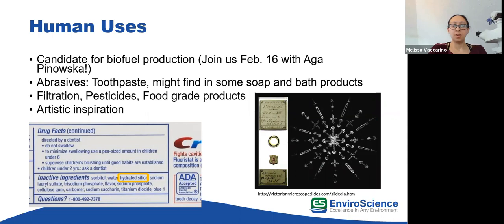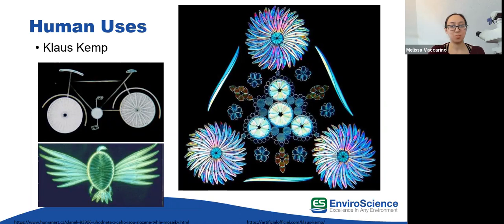And then artistic inspiration. So this slide is a Victorian era slide, and researchers or artists did these as an art form from the 1830s to about 1900, where they arranged diatoms on a slide. And a modern artist is Klaus Kemp, and you can check out his work in a short video.